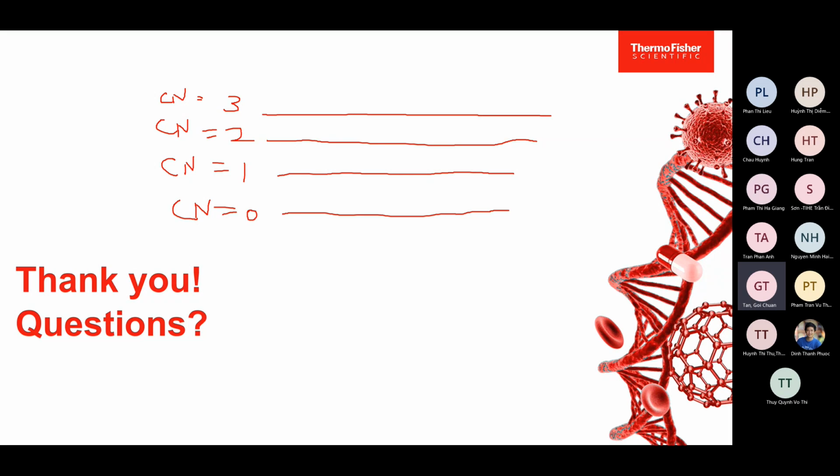Because for example, copy number 0 means that you do not have that at all, right? So nothing here. Copy number 1 maybe just a fraction of it. Copy number 2, copy number 3, and more. It is like gene expression, exactly.